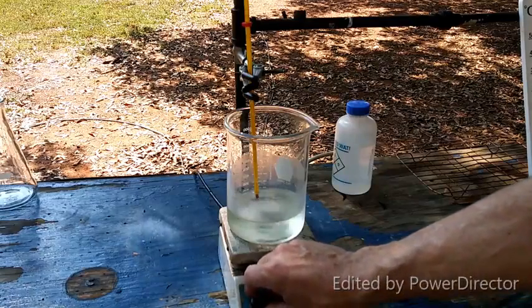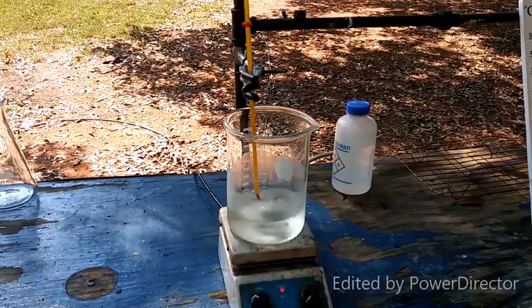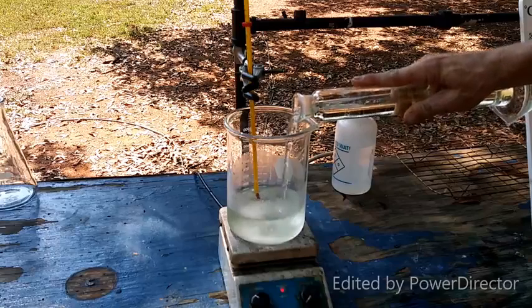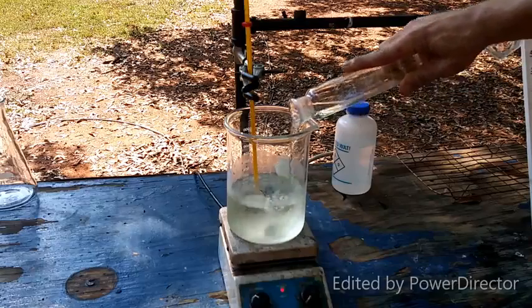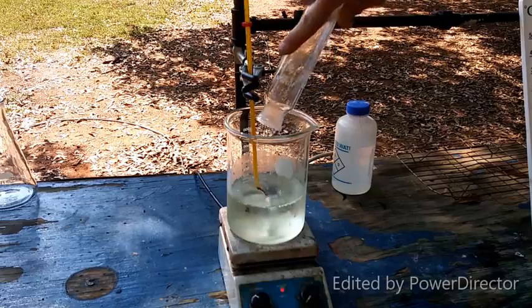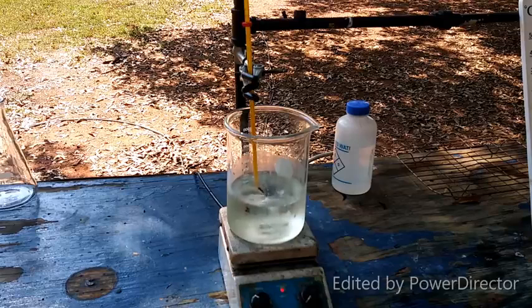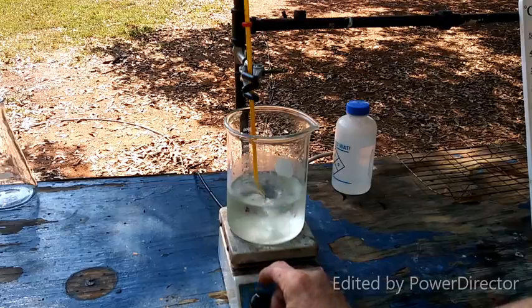But here goes nothing. We have our nice ice-chilled sodium hypochlorite. Add that in. And you notice I had to switch to a bigger beaker. Well, to a beaker, period. Alright, so now we need to let this stir for 15 minutes, and once that's done, we will move on to the next step.